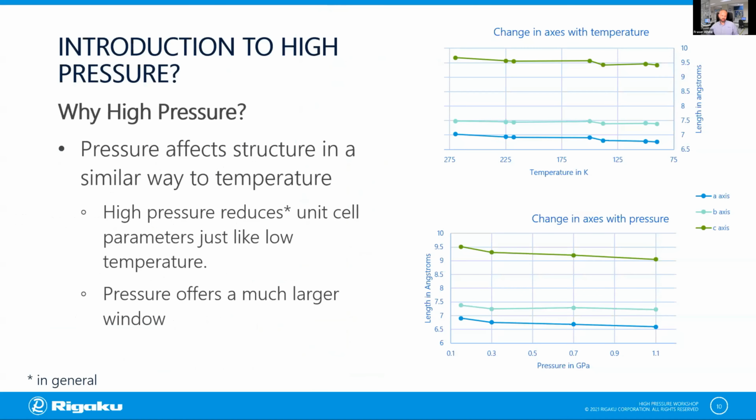So why would you want to study with high pressure in the first place? This is a few graphs I've put together to try and explain what it can do to your structures. When we talk about temperature, which you can see in the top graph here, there is a similarity to high pressure. So there are plenty of reasons why people use temperature in crystallographic experiments.